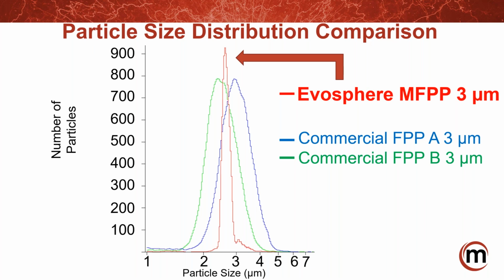And so on the front end, you have a percentage, and on the back end you have a percentage, and then you see two commercially available silicas, like what you're currently using. These are very popular commercial silicas, and you can see just how much wider the two sides of those Gaussian peaks are. So if you can narrow the peaks, if you can compress that peak together on the Coulter counter, you can start to measure the monodispersity of the material.